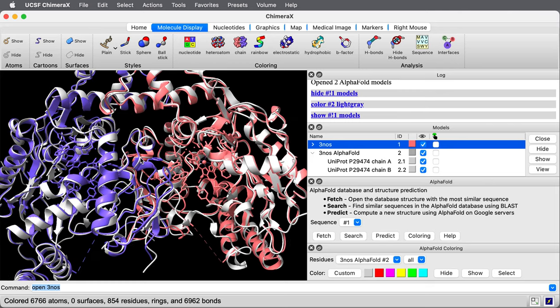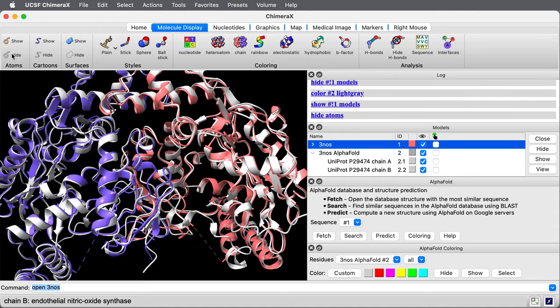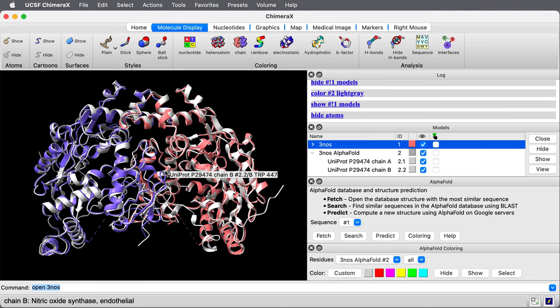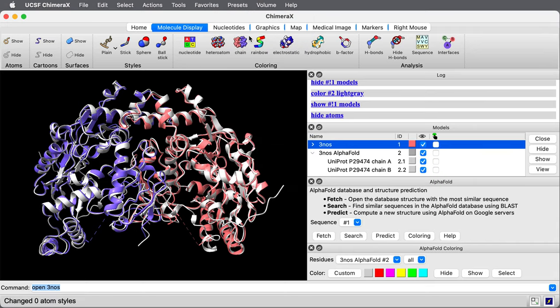Let me simplify the view. I'm going to hide the ligands that are shown as atoms. I'll hide all the atoms. I think I'll show the helices as cylinders to simplify the view a little bit further. I can do that with preset cylinders.